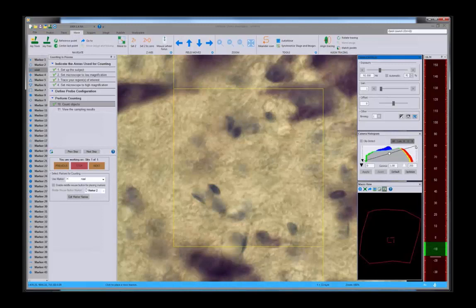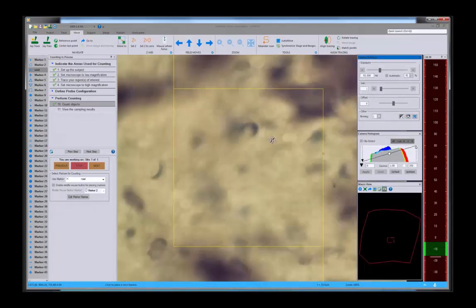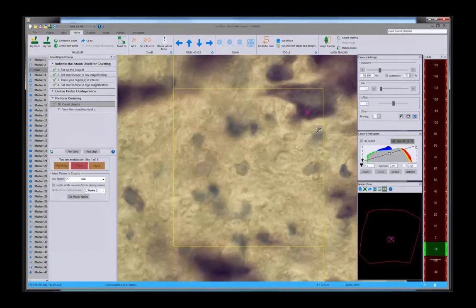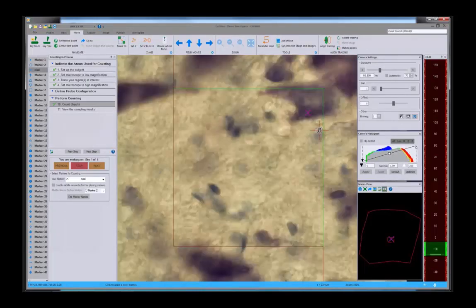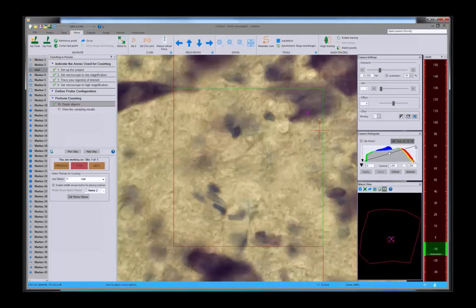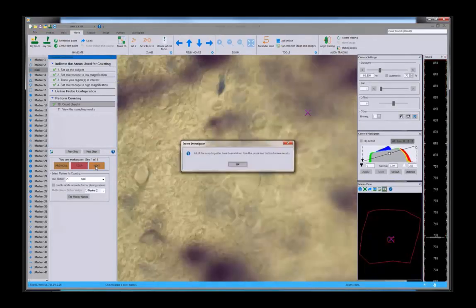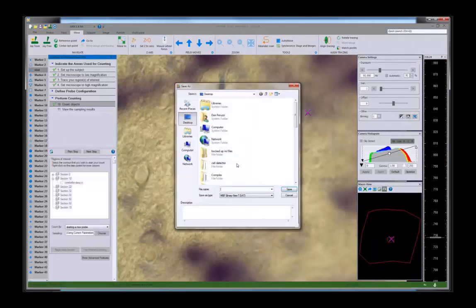Focus back up. Where the dendrite begins and the cell body ends is your judgment call. Again, that won't vary between control and experimental groups. We have controlled for the types of biases that could vary between control and experimental groups. Okay, we haven't done a whole pilot study. We're going to go to the next section.